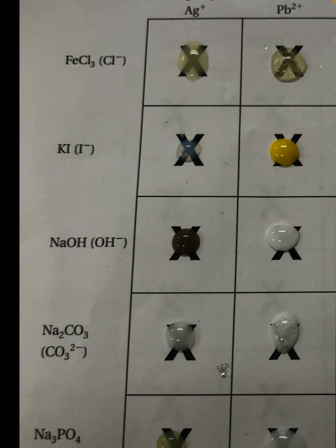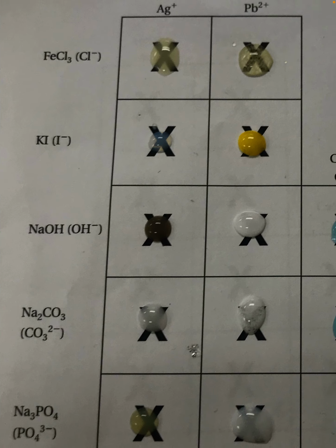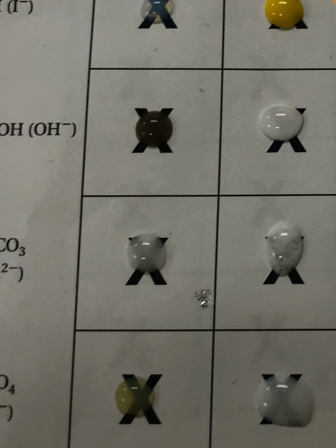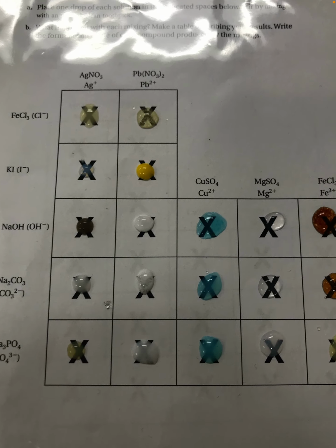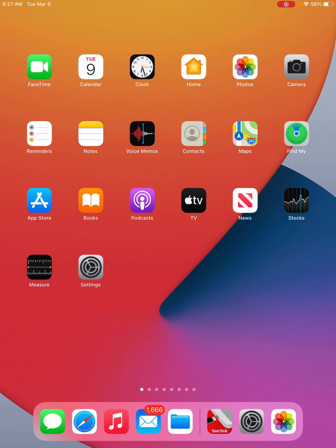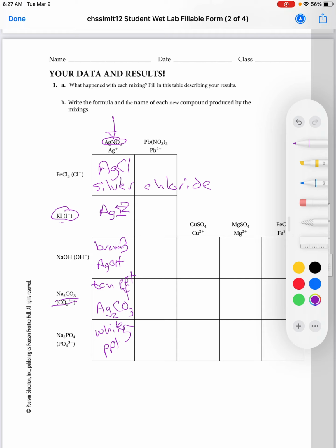Top to bottom in this leftmost row, we had off-white, light yellow, I don't really see light yellow there, brown, definitely brown, tan, sort of tan, and the bottom one says white. Those almost look reversed, but those are the official colors in our precipitates for our products. So you can write what you see, or you can write the answer.